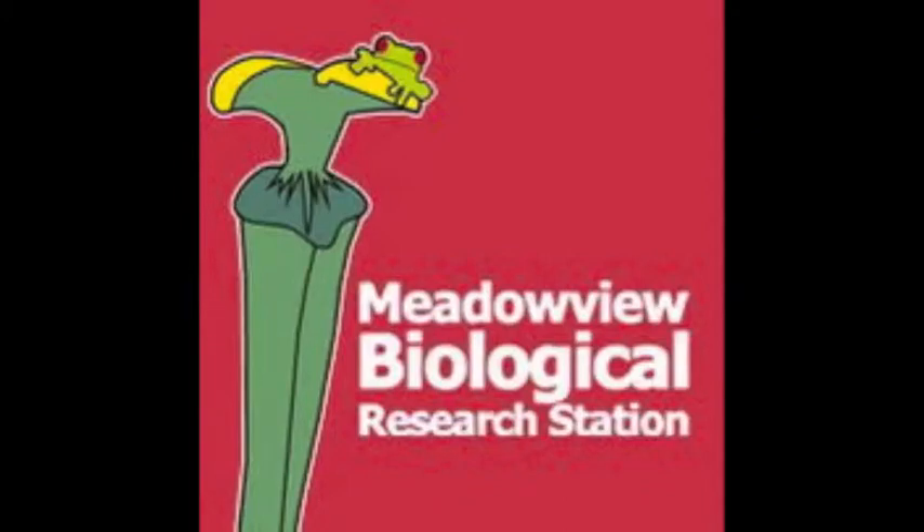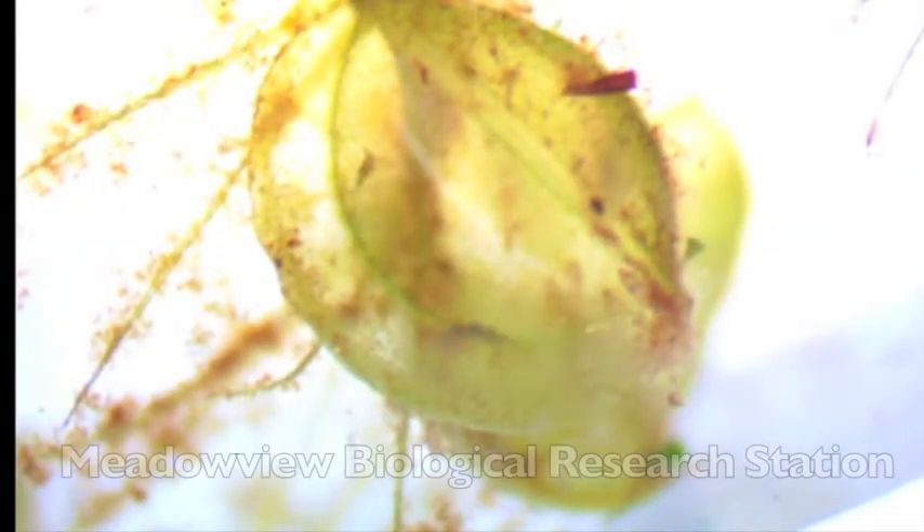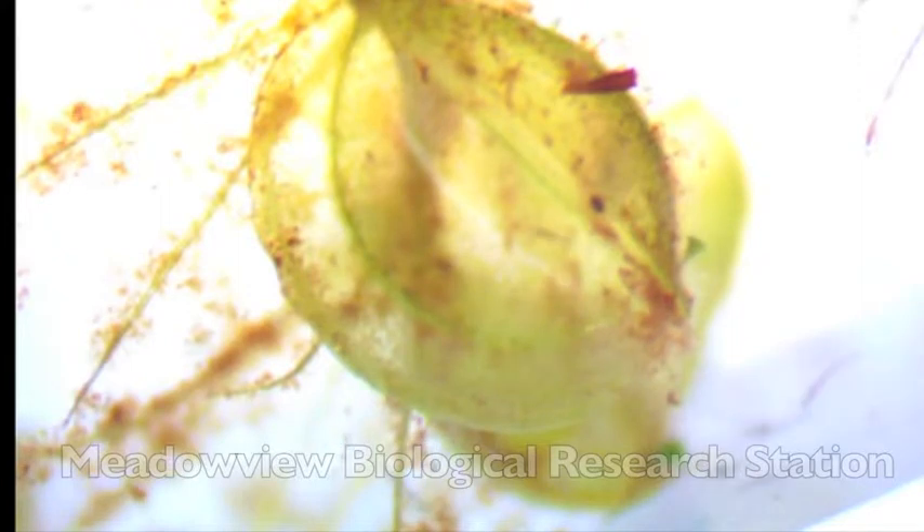Hi and welcome to Meadowview TV. Today we're taking a microscopic look at Aldrovanda vesiculosa, the underwater flytrap.